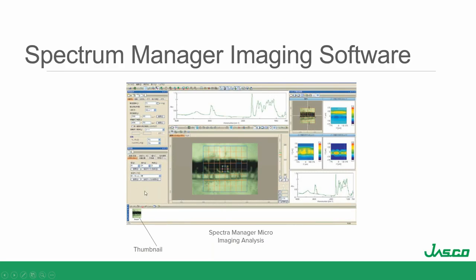This is where you change the aperture. This is where you do most of your microscope side of data collection. This is a live spectrum of where the sample is. Then you can take this and map, and you can start the map before you're done and actually see it populate as it goes down.